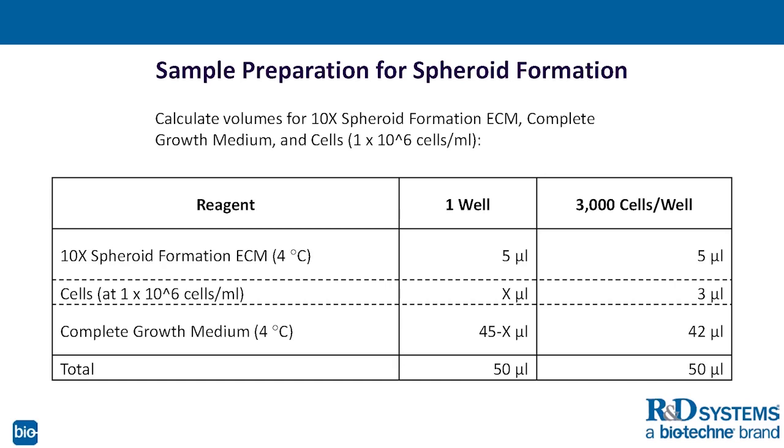And this is an important point to mention, that different cell lines have a different size, and generally what we're looking to do is create a spheroid of a specific size, between 400 and 600 microns in diameter. This is where we see a lot of these physiological gradients created. So this may require a little optimization based on your cell model.